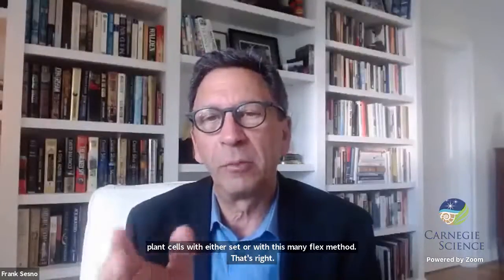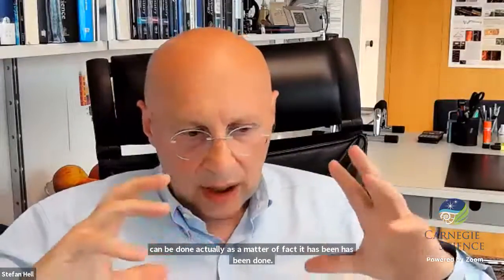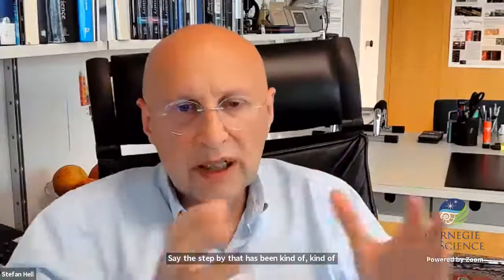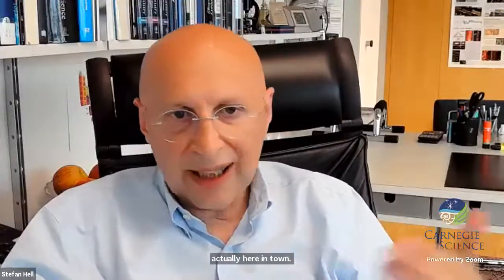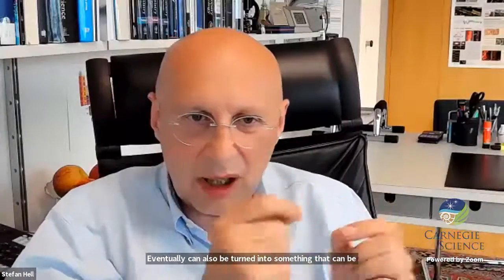That's right. John has a question. How practical and expensive, he asks, is this technology? For example, could museums use it in educational programs as they do with electron microscopy? It can be done. Actually, as a matter of fact, it has been done. The STED method has been turned into a museum device here in town, and that is possible. The other method can eventually also be turned into something that can be used in a museum, but it's not so easy to see the single molecules going on and off.